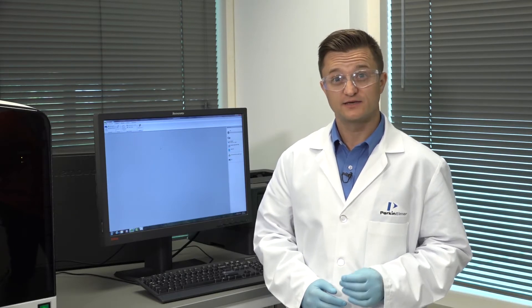Syngistics for AA is the software that controls the Perkin Elmer Pinnacle series atomic absorption instruments. You may also have it on your Perkin Elmer ICP-OES or ICP-MS instruments. It is also compatible with the Analyst series and the Perkin Elmer flow injection mercury system.